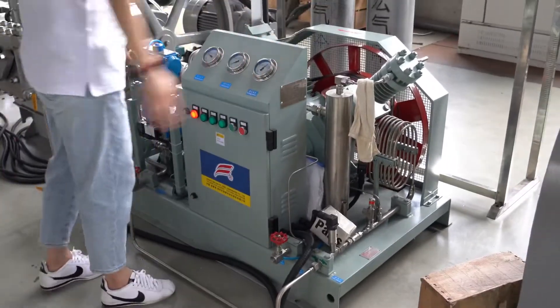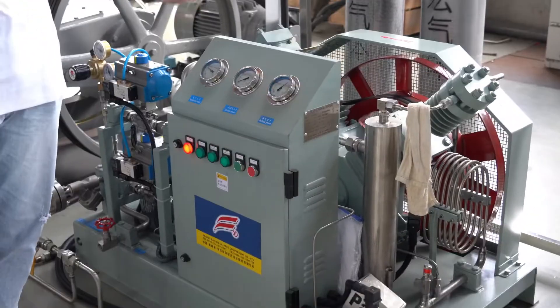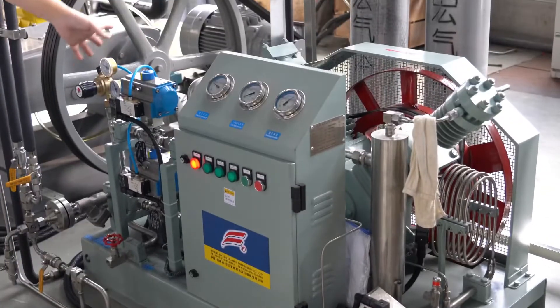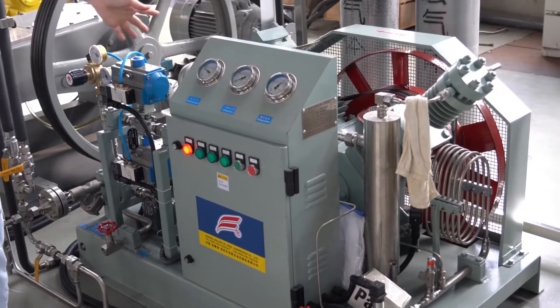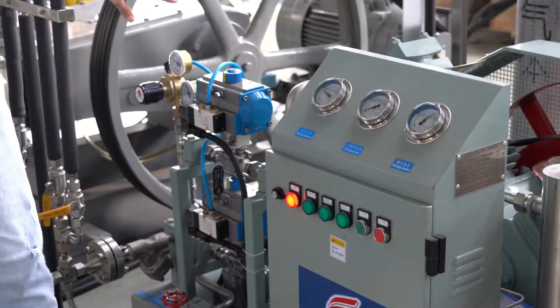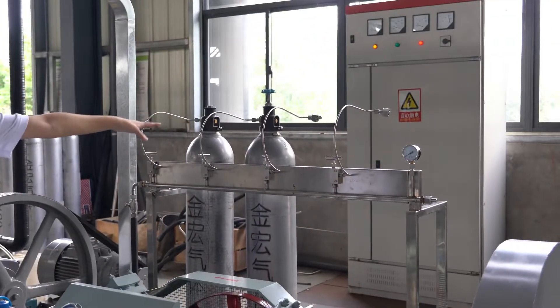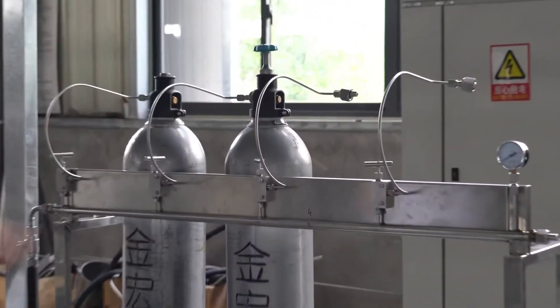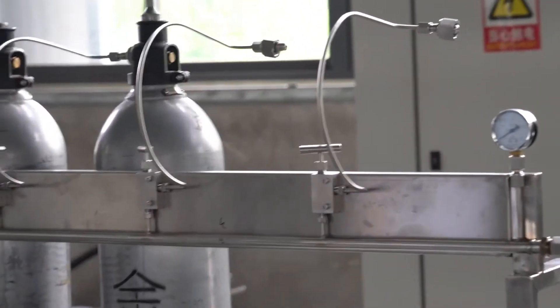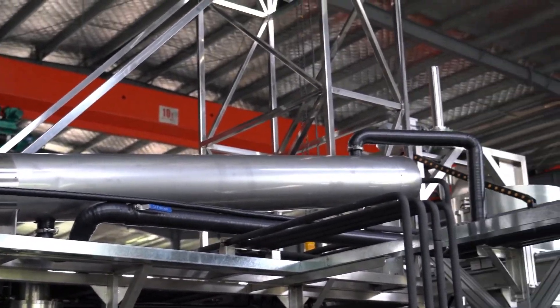Here is the carbon dioxide recovery pump. It helps recover the carbon dioxide after the extraction is finished, which can save a lot of carbon dioxide. We also have the carbon dioxide bottle frames, which can support carbon dioxide bottles. The condenser can perform a better cooling function.